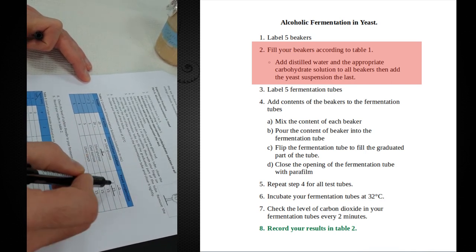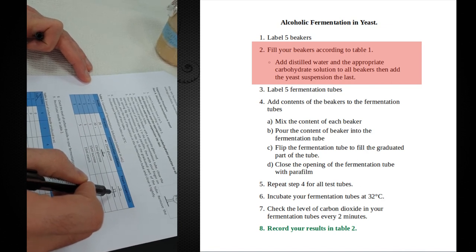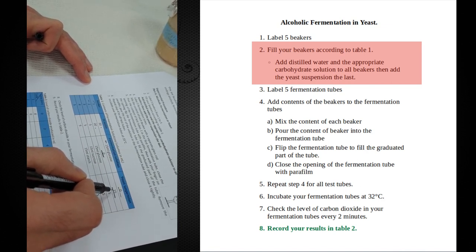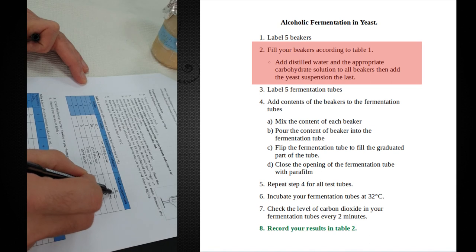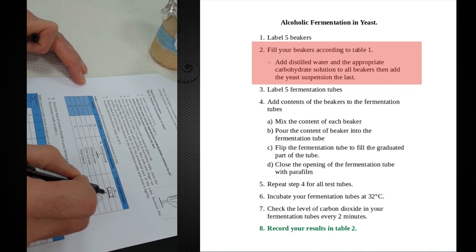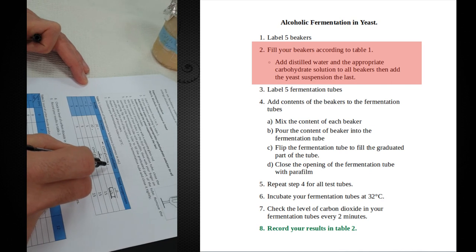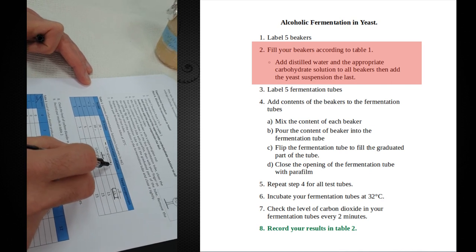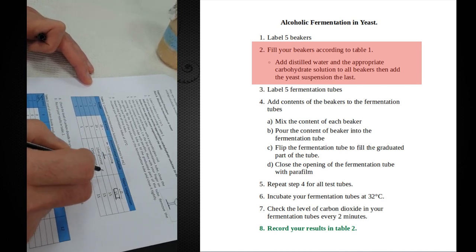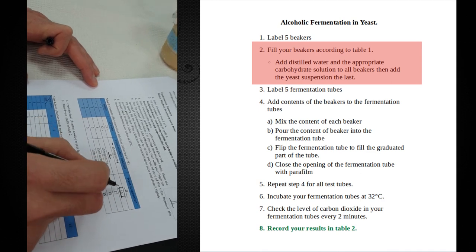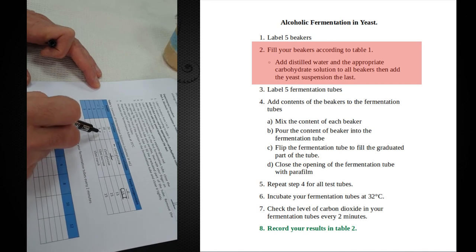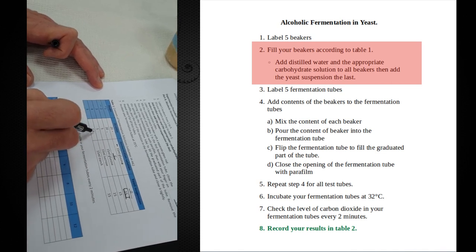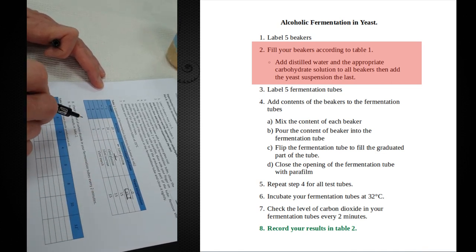There are two different components that this reaction relies on. The reaction requires a substrate, which is the glucose, and the reaction requires an enzyme, which is inside the yeast. We're going to test in each one of these cases whether on its own this is able to produce any gas, or on its own this yeast is able to produce any gas. So these are going to be our negative controls. The remaining three beakers are going to get just a little bit of water just to make sure that the total volume is the same for all of them.